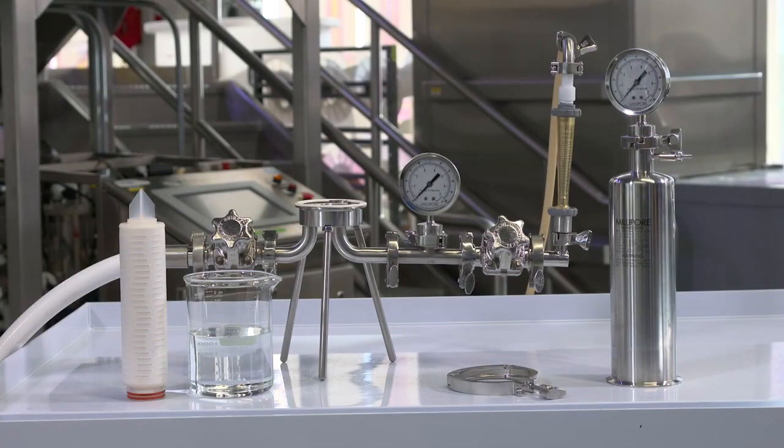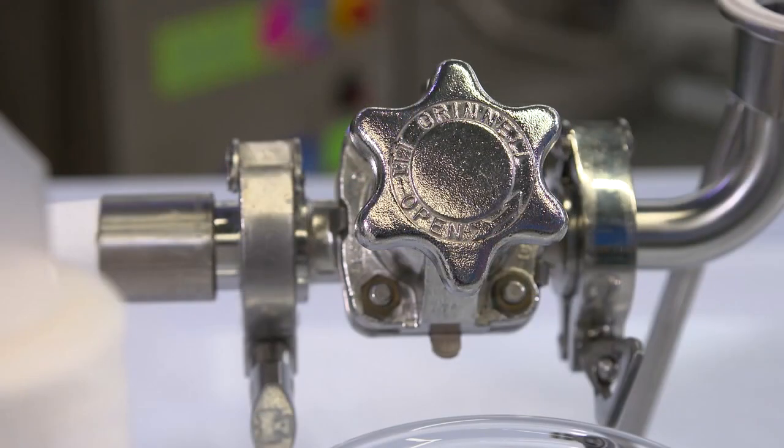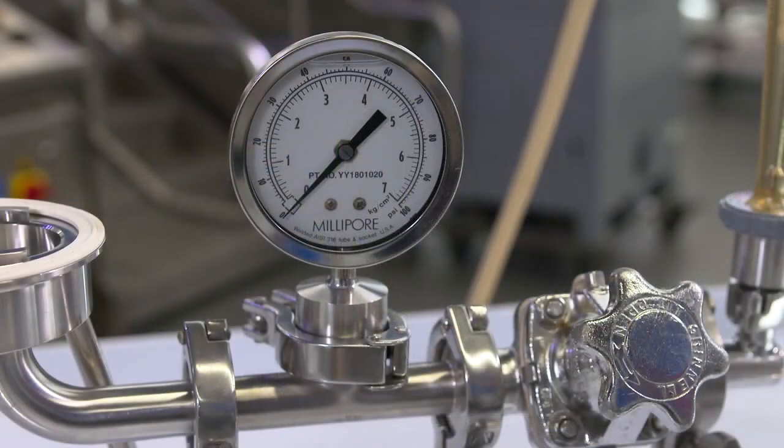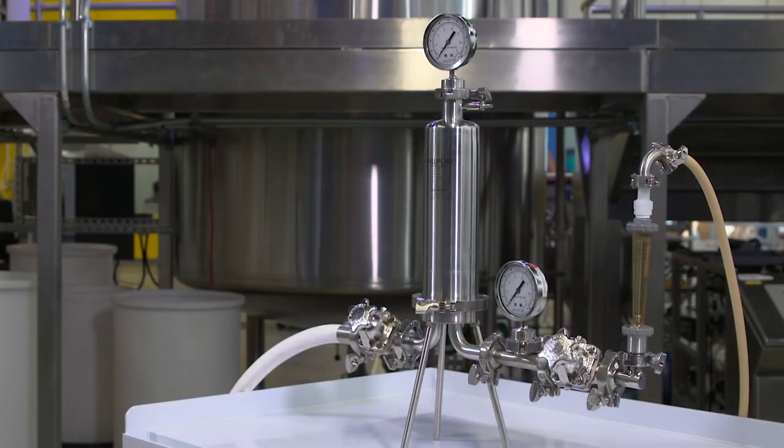Let's begin by looking at the key components of the system. It is important to be able to control the wetting flow rate using valves and to be able to monitor the flow with gauges or a flow meter. Ideally, we have gauges immediately upstream and downstream of the filter in order to get a clear assessment of the differential pressure.